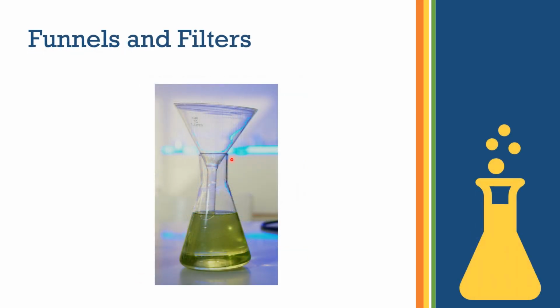Funnels are used to channel liquids or fine-grained substances into containers with a small opening. Filters, often used with funnels, are used to separate solids from liquids. This combination is essential for various purification and separation techniques.